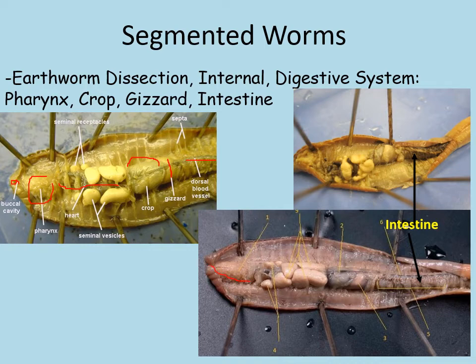Pharynx looks like kind of a thick region. So here it is in this picture here. There's the pharynx. And this one's a little bit harder to see, but it would be right there. Esophagus, difficult to see, so you don't have to recognize it on the final exam. But then these 2 structures are easier to see.